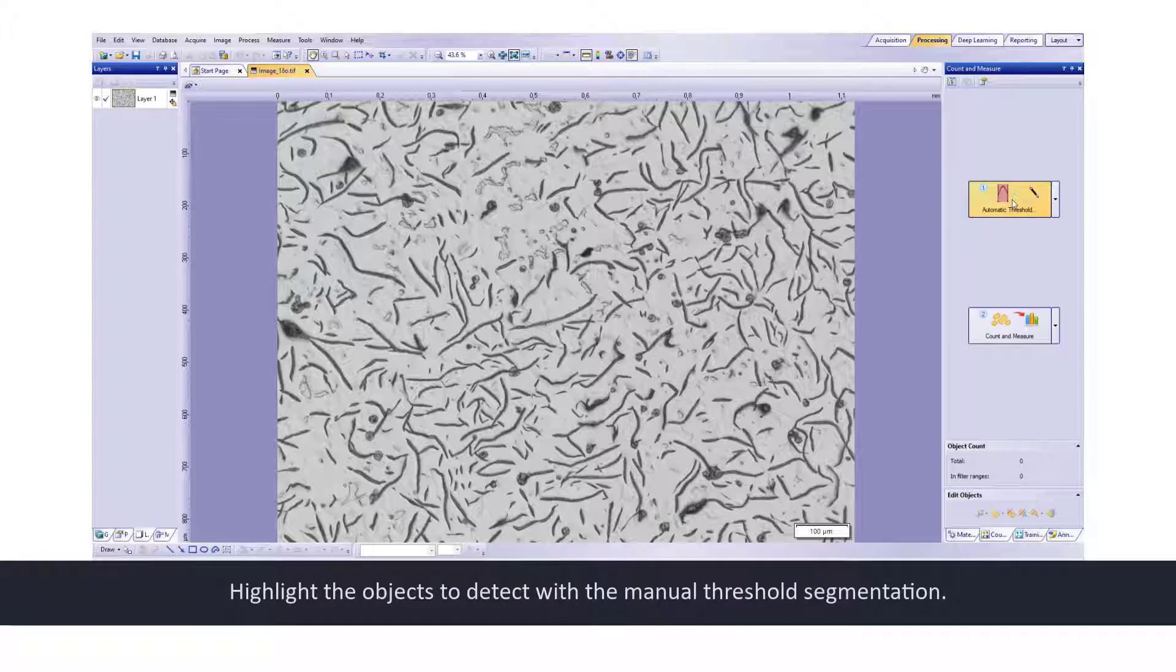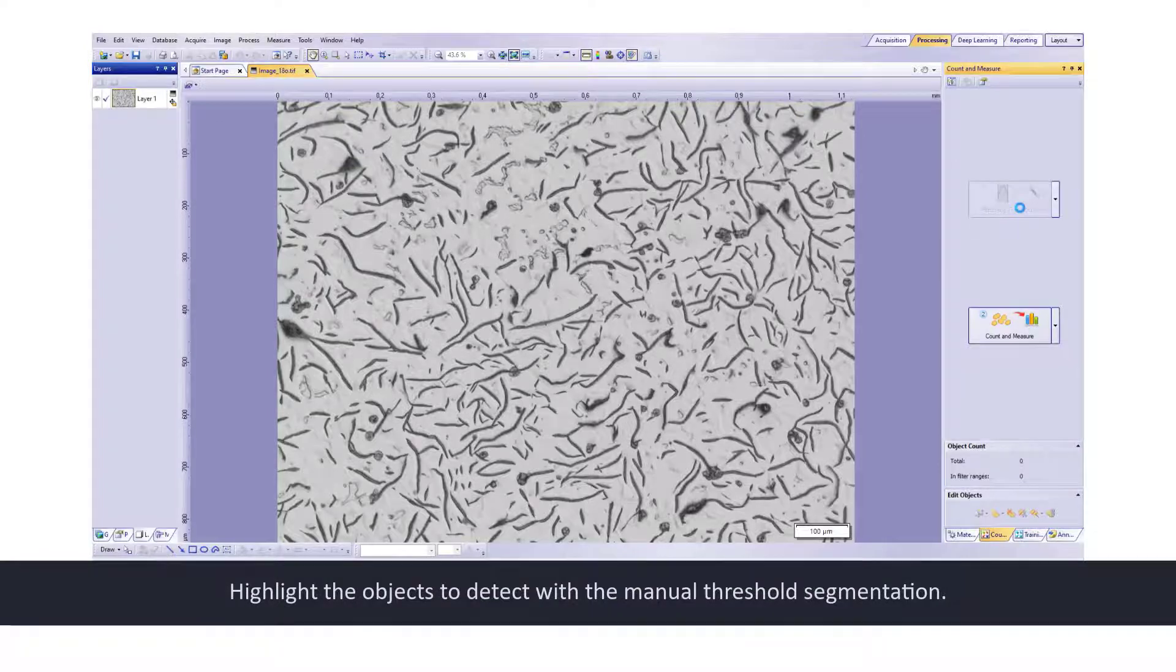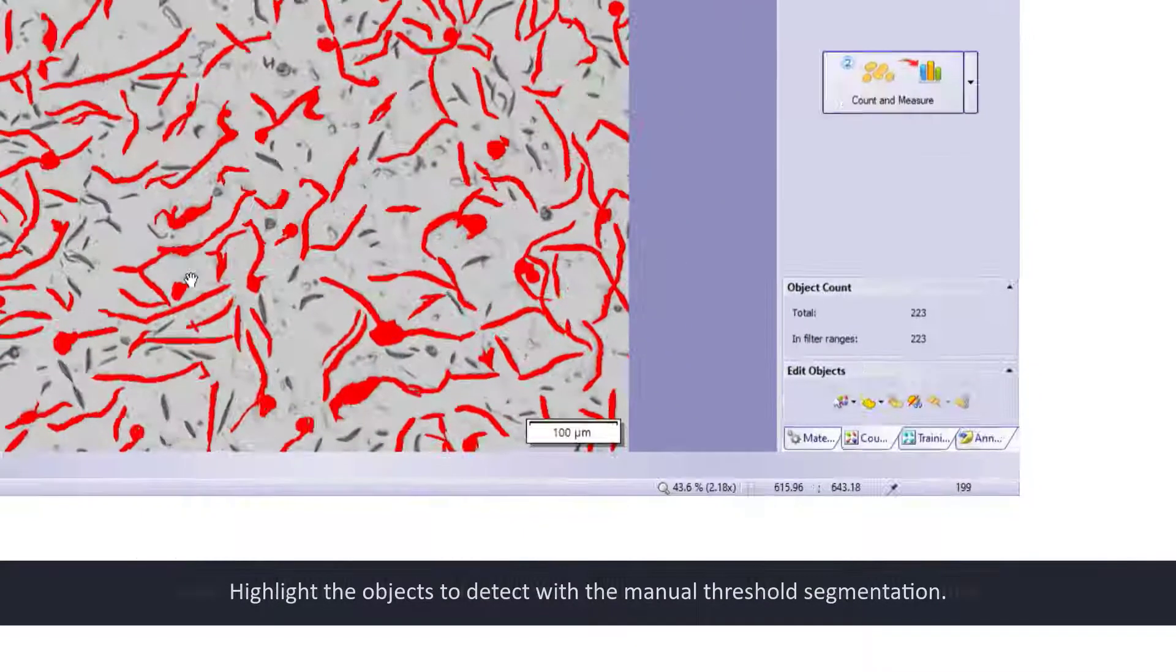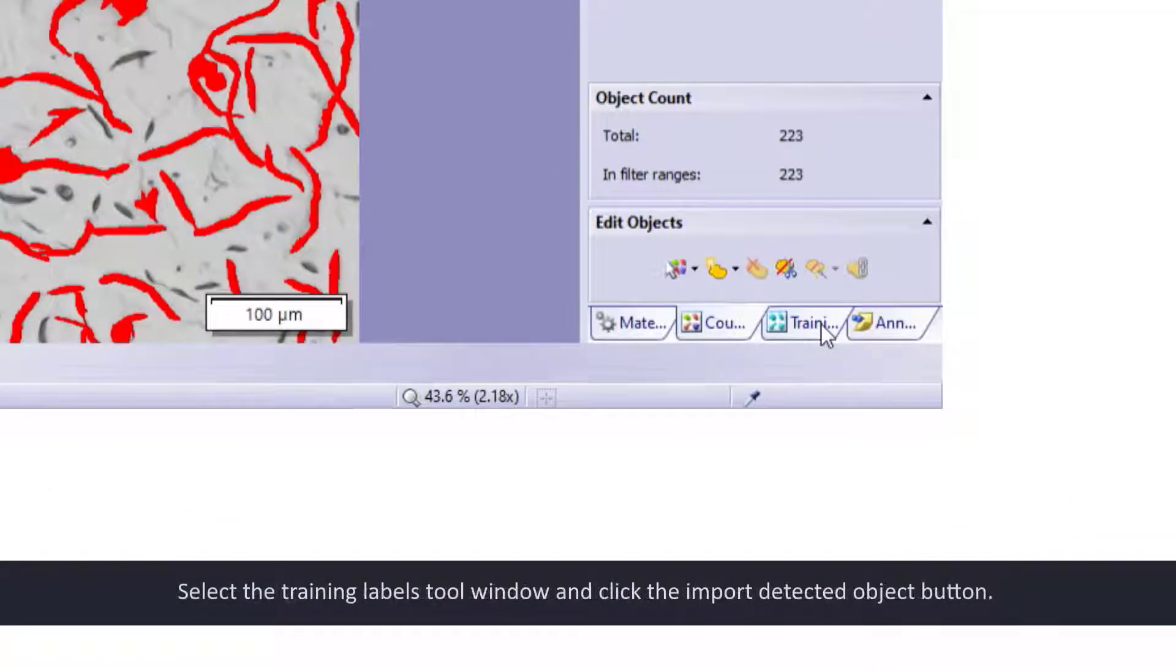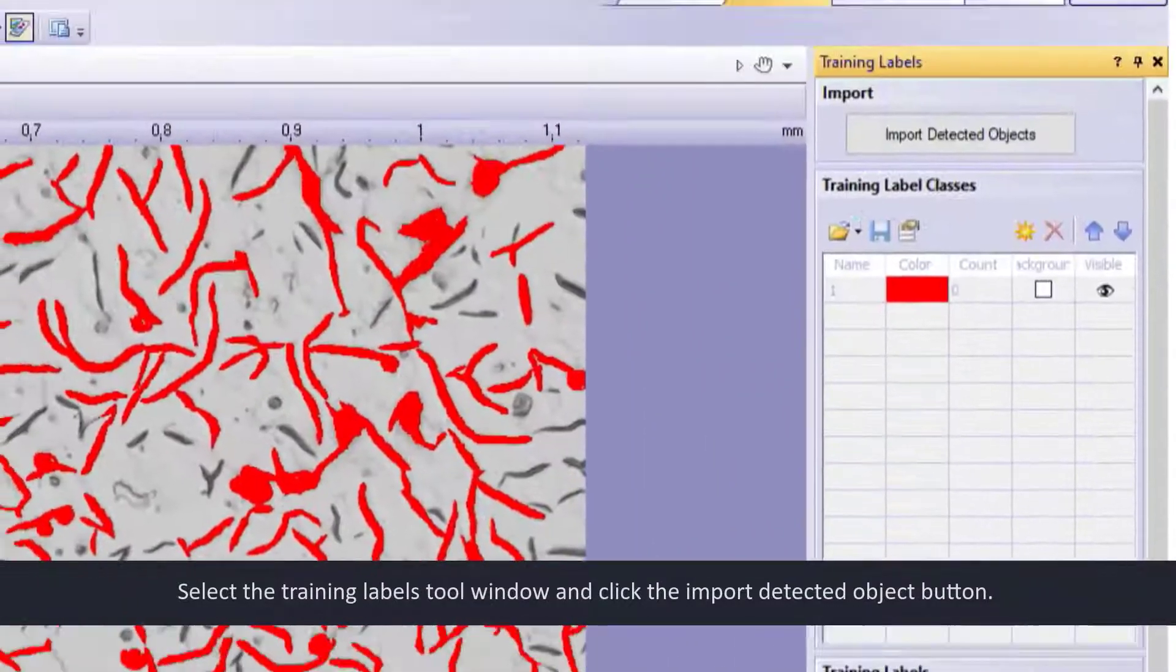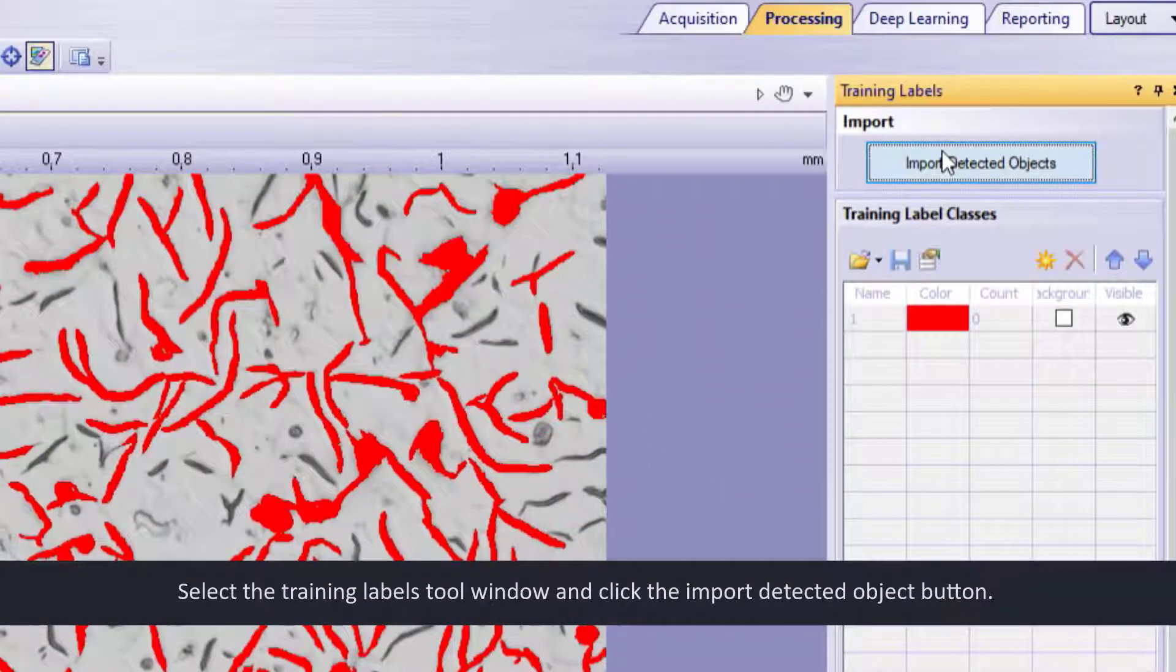Highlight the objects to detect with the manual threshold segmentation. Select the training labels tool window and click the import detected object button.